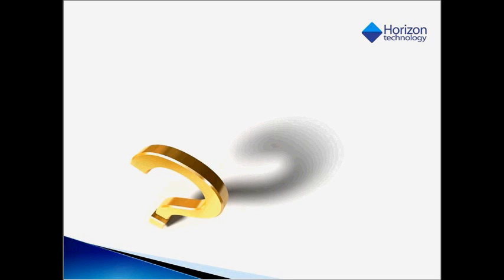Okay, we have a few questions at the time. Let's go back. If I press return here, you will have question and answers on the right-hand side. The first question we get is, can't I get the same result with SPE cartridges rather than disks?